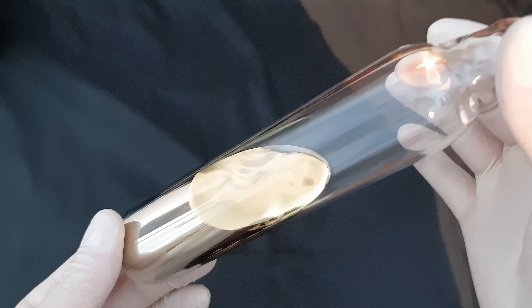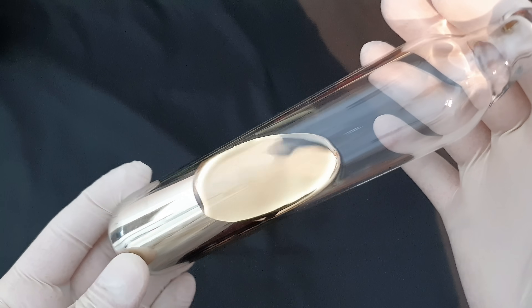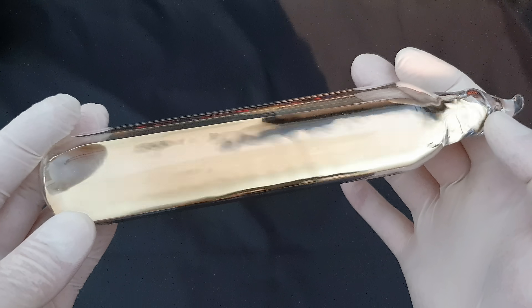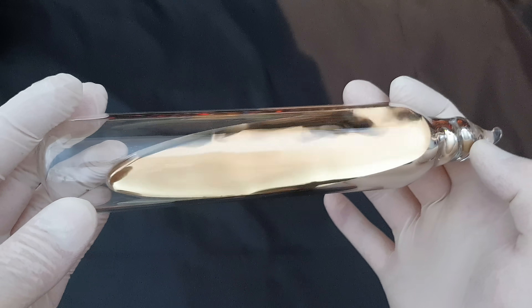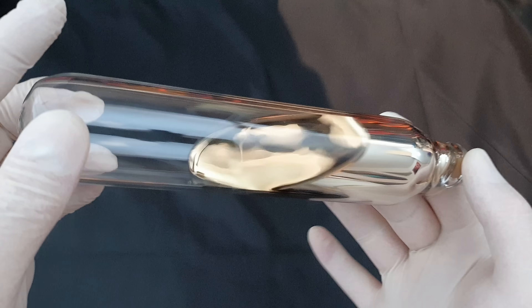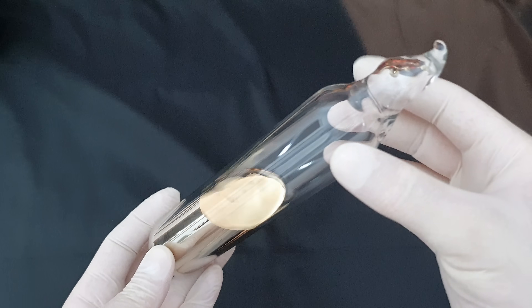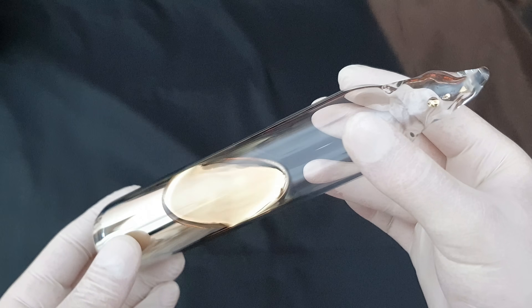The only vial getting close in terms of the mass of cesium is a 130g vial shown by the channel of Smart Elements, a commercial seller, which means it is — contrary to mine — not homemade. But this vial is not only massive, it's also absolutely pure. As you can see, the cesium does not stick to the glass at all.